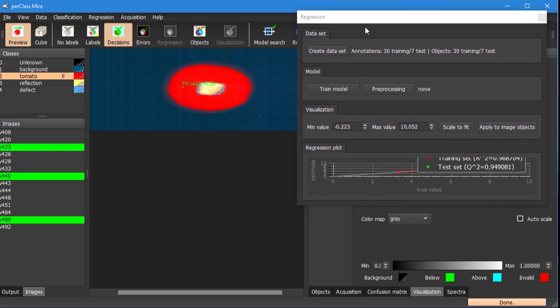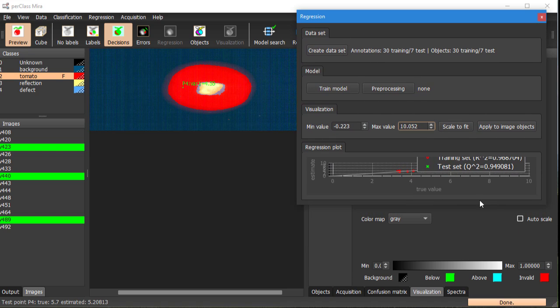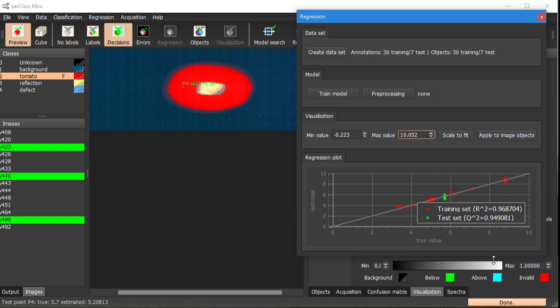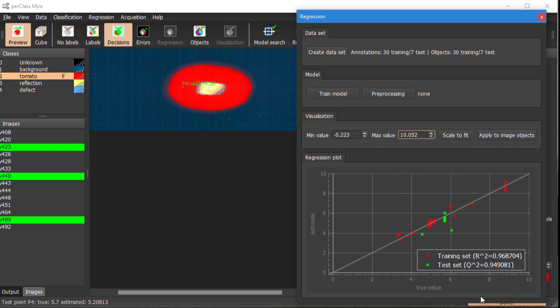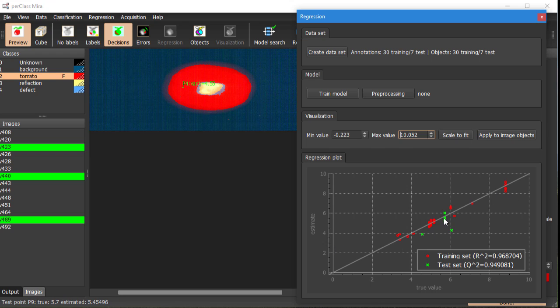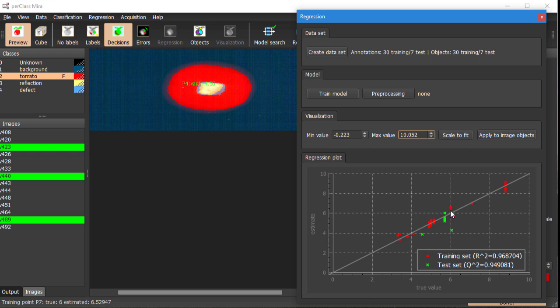So we got our first regression model trained. You see in this plot the true value and the estimated value of the bricks and each of these individual points is representing one piece of tomato. The red points are from the training set and green from the test set. When we move around these points we can see in the status bar which specific point we are looking at and also the true and estimated value.